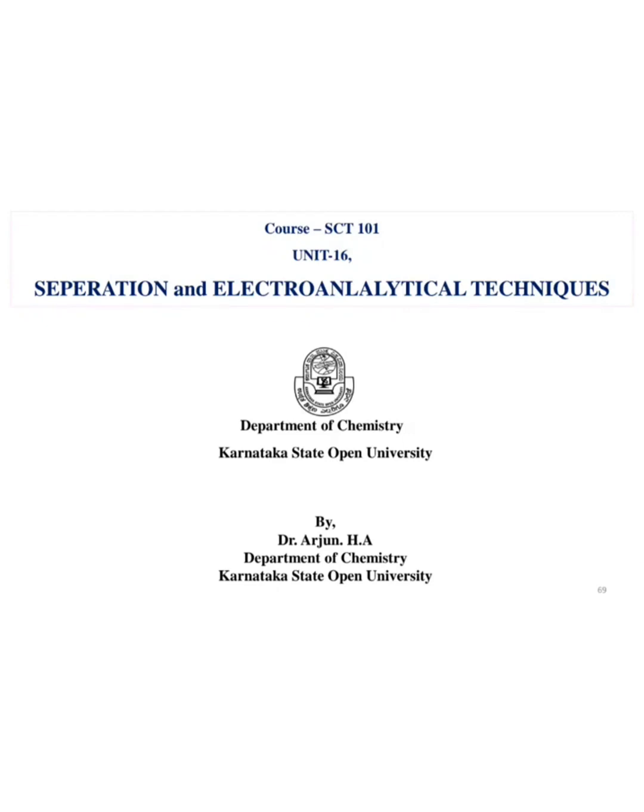In this unit, that is unit 16, we are going to study the mechanism of ion exchange chromatography. Previously we have studied what chromatography is, the classification of chromatography, and the different types of chromatography and their principles, instrumentation and applications.